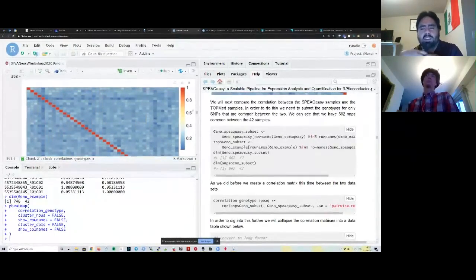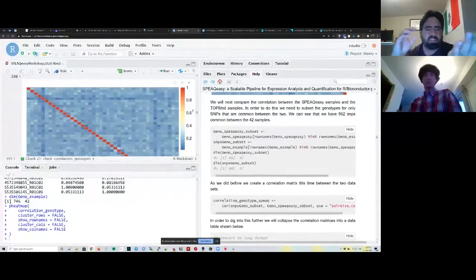So I would imagine that in your case, when you're transplanting from one donor to a second donor, you might actually have on the RNA side data from donor cells and the transplant recipient cells, right? So that's why you might have a little bit of a mix.